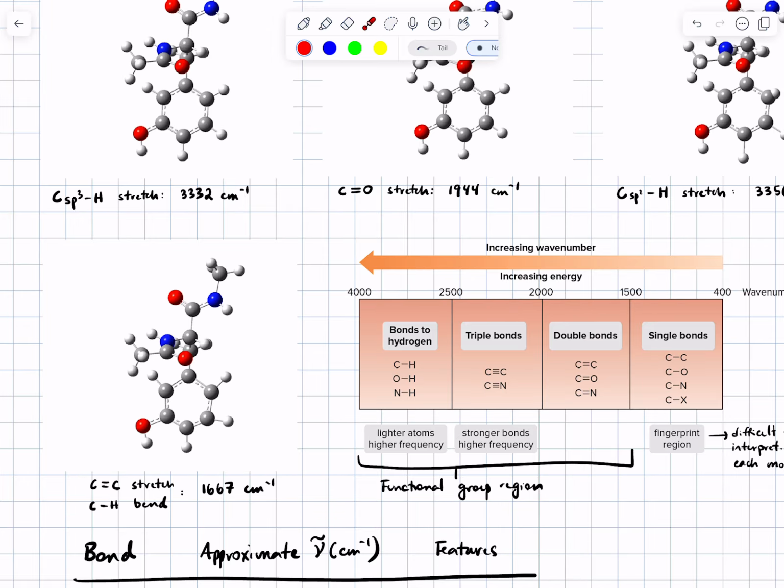How do you know what part of the molecule is going to absorb the light? The answer is you don't until you do a calculation that can predict it. But then based on experience and based on those calculations, there are characteristic signals that are consistent with specific bond vibrations. And so once you know what those patterns are, you can then look at data for an unknown molecule and say, oh, I recognize that. That's probably this kind of bond.